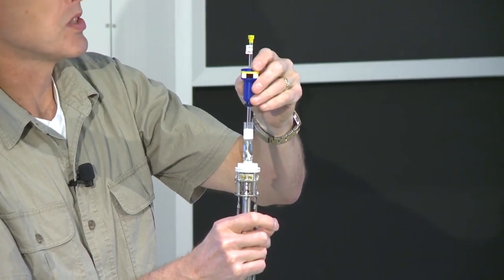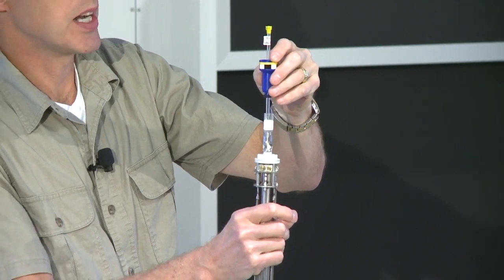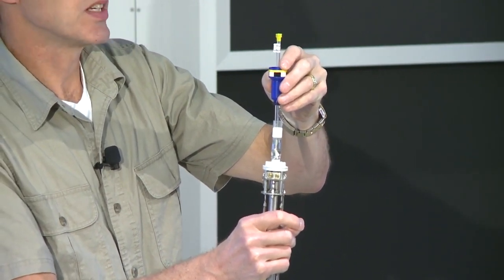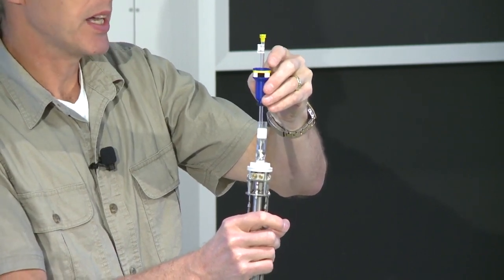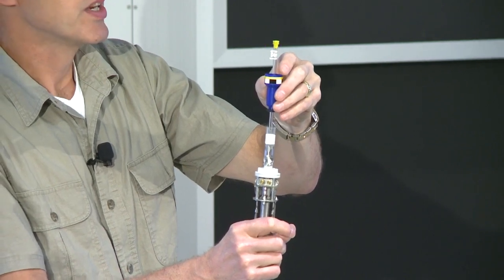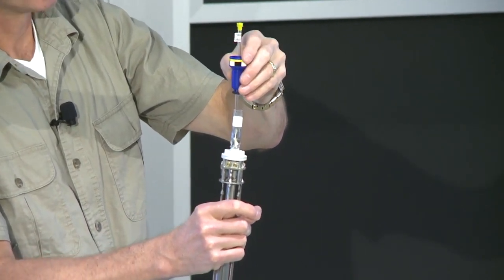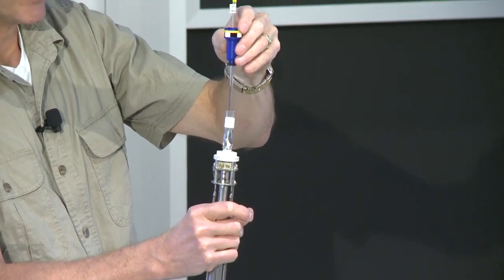And so the coils of wire will send the signal to your sample that's being generated in the console. And then when that signal gets turned off, your sample will relax back to its equilibrium state, and it will induce a small voltage in these coils, which gets picked up, sent back through that console and off to the computer to generate your spectrum.